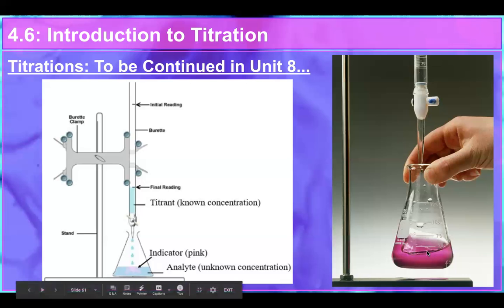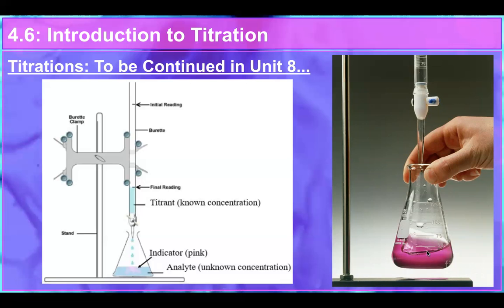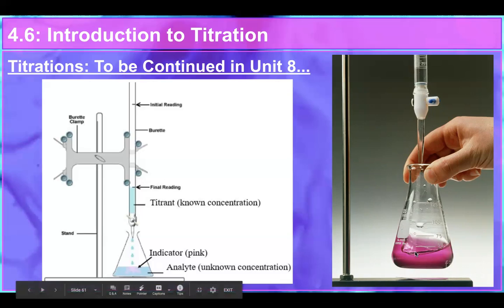Okay. So right here, looks like we had an acidic solution with phenolphthalein in it, and then we were adding base, and now it is really, really pink, which means that it has bypassed the equivalence point now.